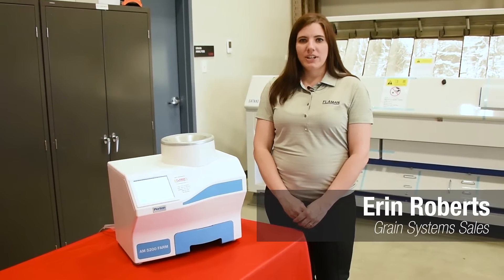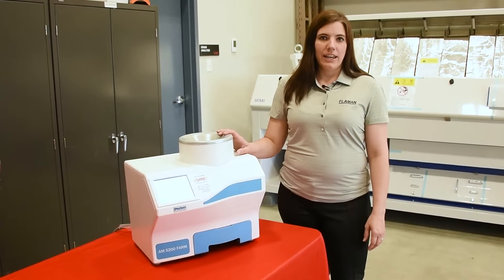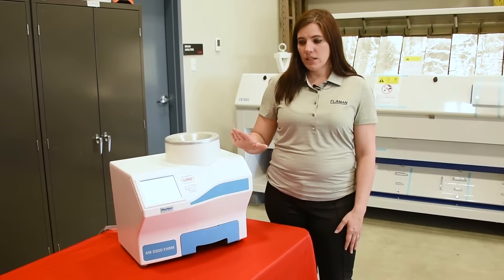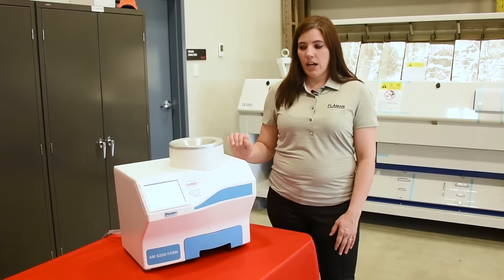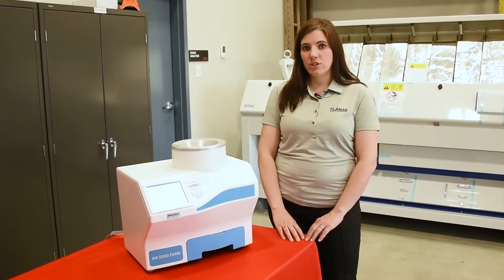Hi, I'm Erin from Flaman Grain Systems in Saskatoon. Today I'm going to show you about our AM5200 farm moisture meter. This is our stationary economical moisture meter which uses UGMA technology and 150 megahertz of radio wave frequency to determine the moisture in different grains.